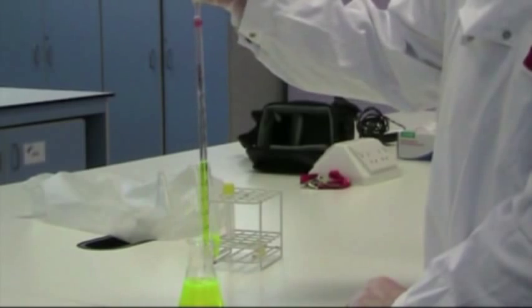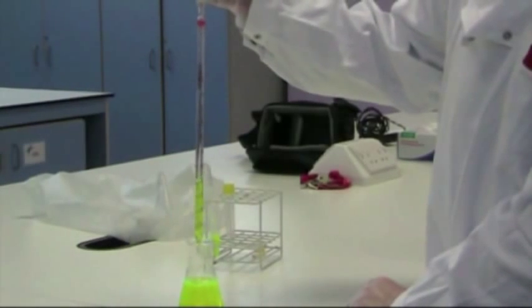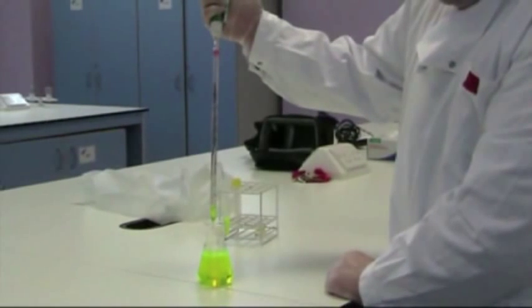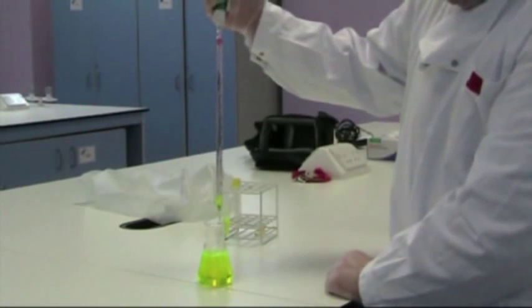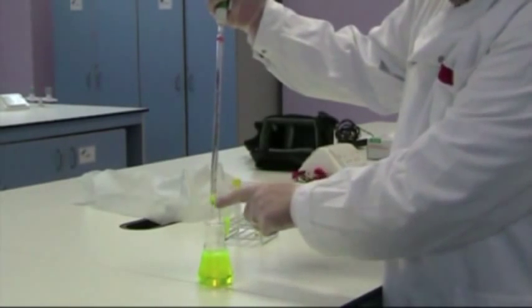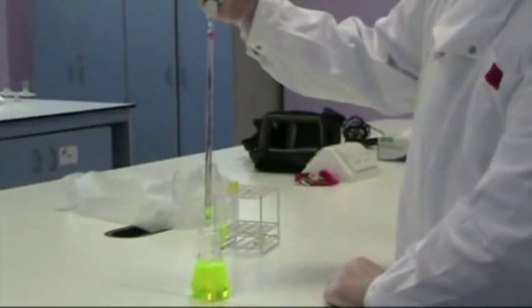It's not advisable to take it past the 9 point to dispense, because as you'll see when I get to that point, stop from there, because there's often an air bubble that forms at the bottom. So never use this portion to dispense your liquid accurately.